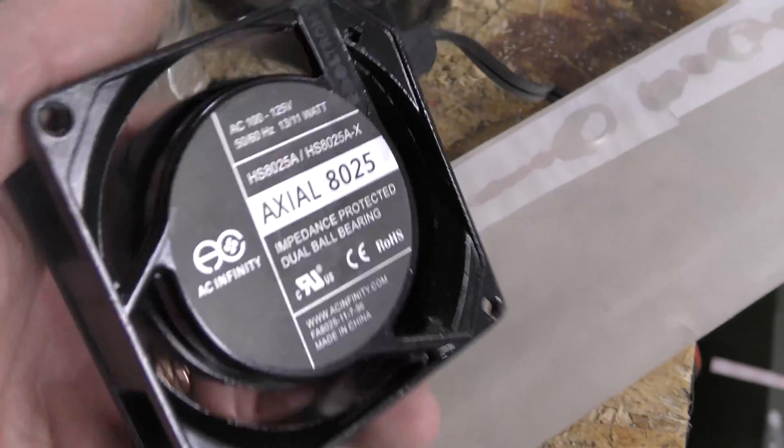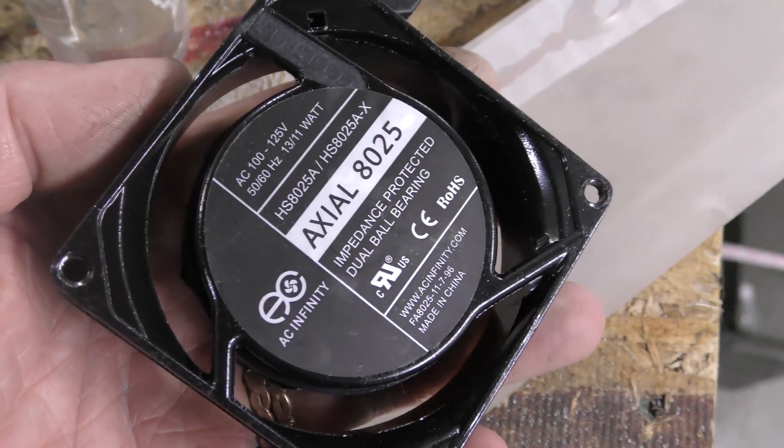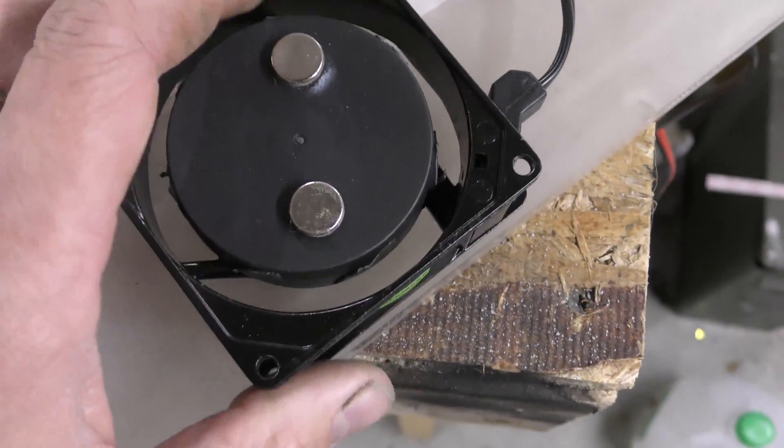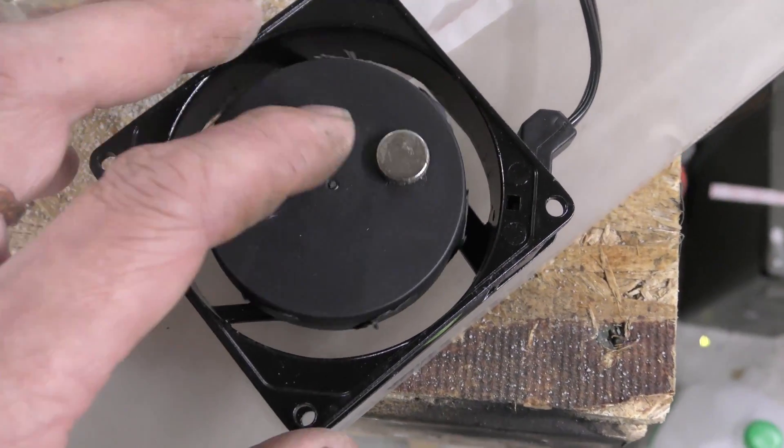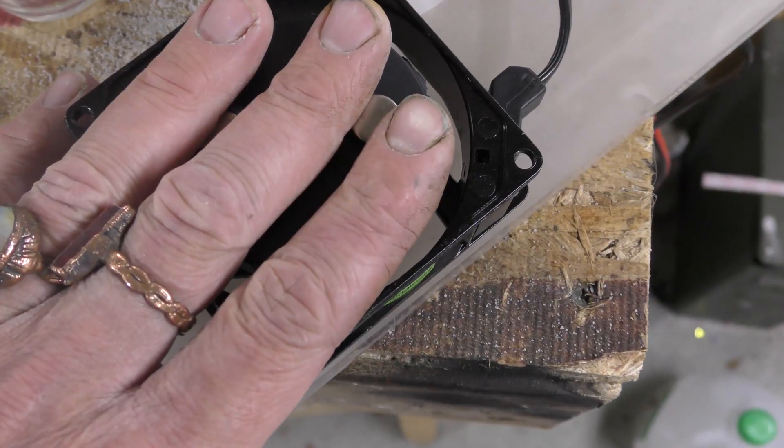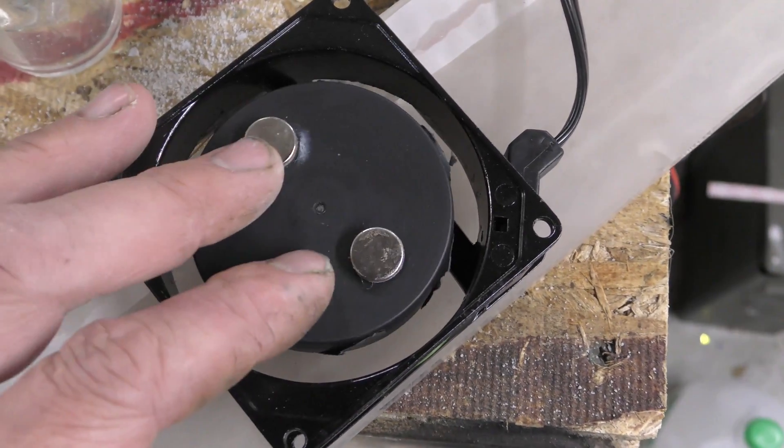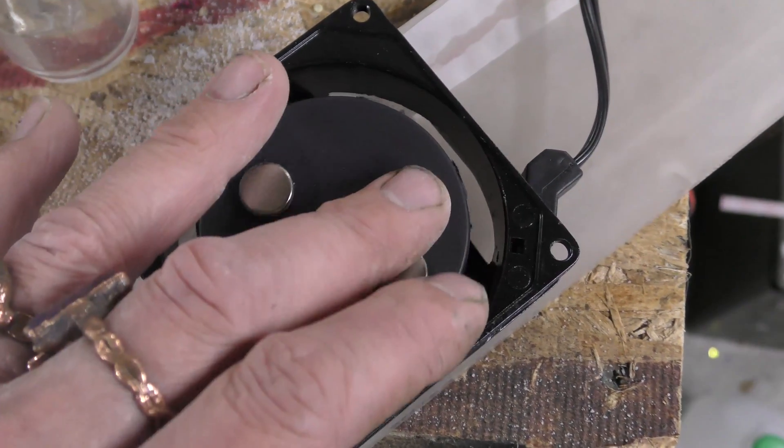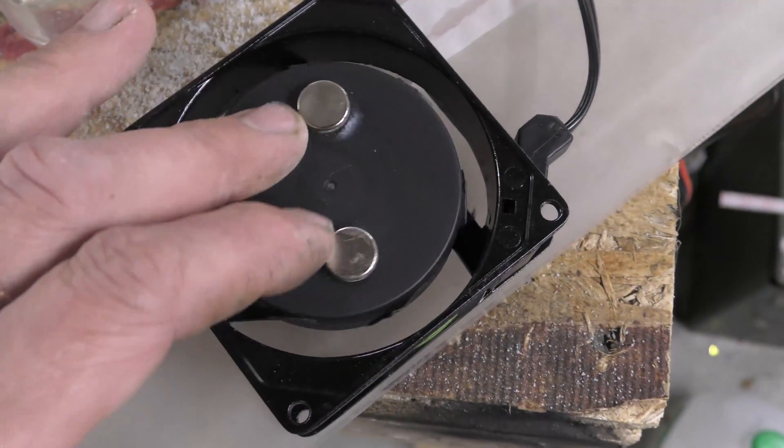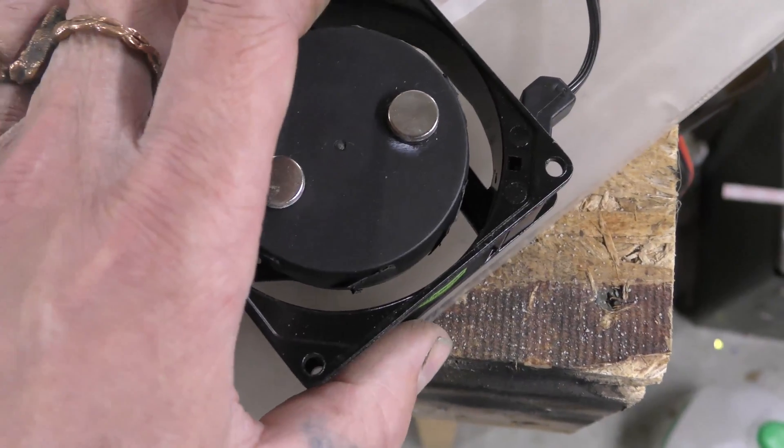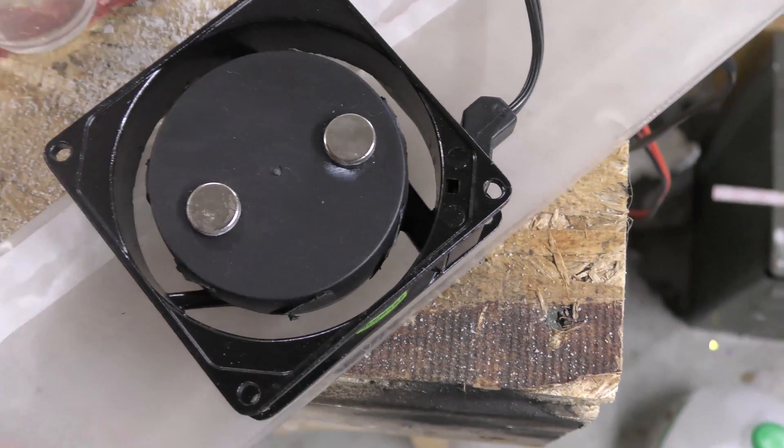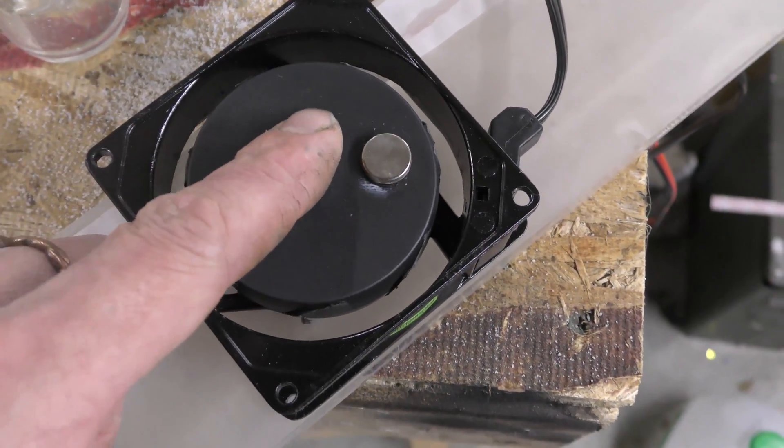So the fans do get a little hot. Do not waste your money on this thing. These are AC current fans. I had one of these laying around and I just cut the fans off. These will overheat very hot. Don't do this. The torque is too high. The viscosity of the liquid makes the fan heat up. And it was so hot that I had to put a glove on just to get it out of there. So don't do the AC current.